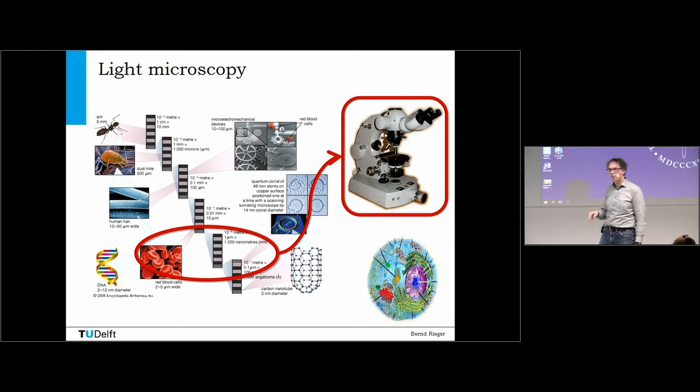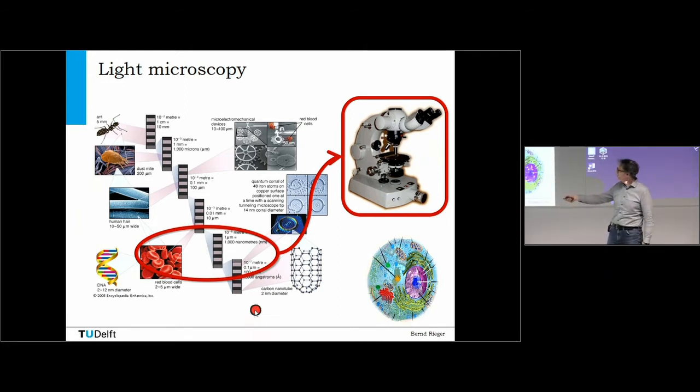What I will talk about today is light microscopy data. But of course, the same type of data images will also be acquired in electron microscopy, that can be used typically for smaller things. That would be a bit smaller, maybe on the nanometer scale, the size of the DNA, for example. But the problems that I will talk about will be the same for light microscopy and electron microscopy.